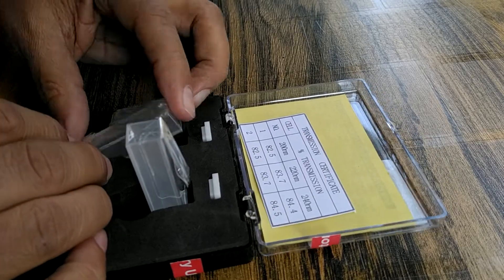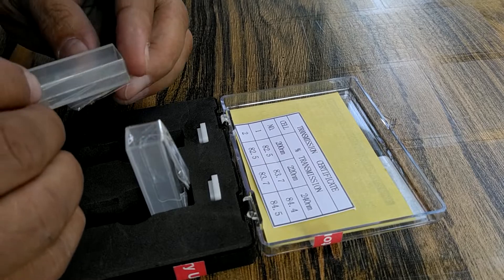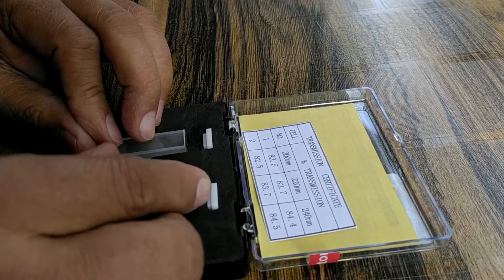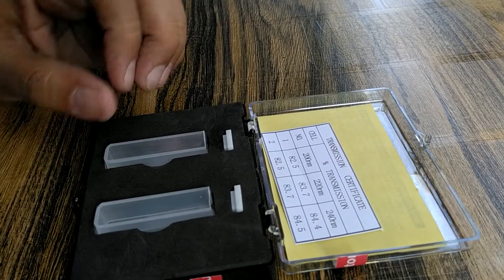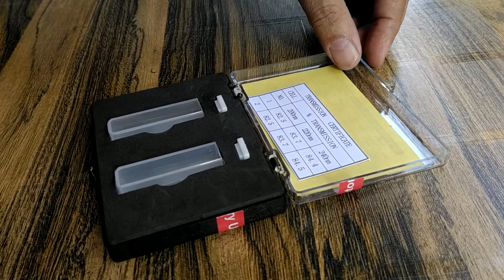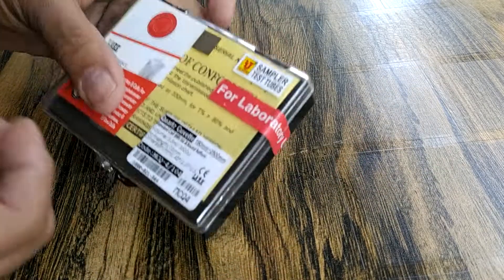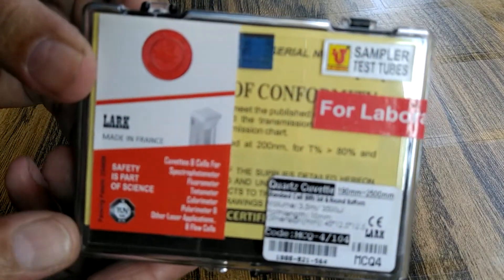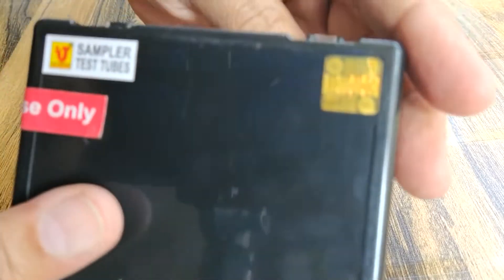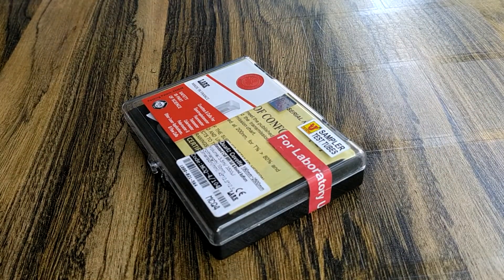So, table 4, visible and UV visible spectrophotometers. Packs.